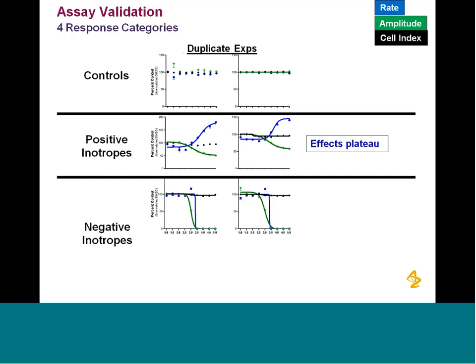We have looked at hypertrophy, and I don't have anything exciting to offer. And as for cell index and serum, the problem as you go down in serum is that the beats are not as robust or consistent. So I was less interested in the cell index. What I really wanted was consistent, stable beating. And so that's how we drove our assay development.